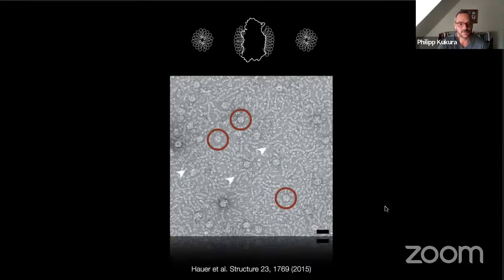All right, the next one was membrane proteins, right? As I said before, membrane proteins like to be in bilayers, so you have to solubilize them and put them in a detergent. The problem when you do that you can see quite nicely here. This is what everyone in cryo-EM has the same problem with: if you just put protein in a detergent and you stick them in the EM, all you see is detergent, because there's a lot of detergent out there in addition to protein within detergent. And of course, because we see everything, we will also see a lot of detergent.